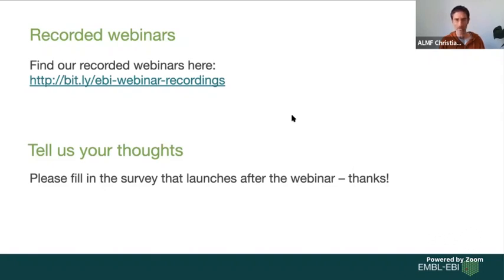I think it's called Microscopy Image Browser. I'm really sorry if this is not right. This MIB, I think this is really made for electron microscopy, free software. So I think that was the name. Check it. Otherwise, ask again on the forum. That one is really specific for EM, I think.